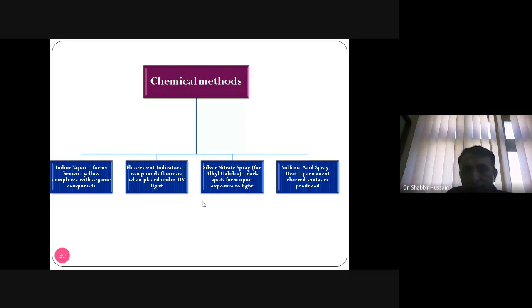इसमें से 2 अहम वो हैं, एक सीरिक सल्फेट सॉल्यूशन है, one is ceric sulfate solution for visualization of all organic compounds, and another is Dragendorff reagent.